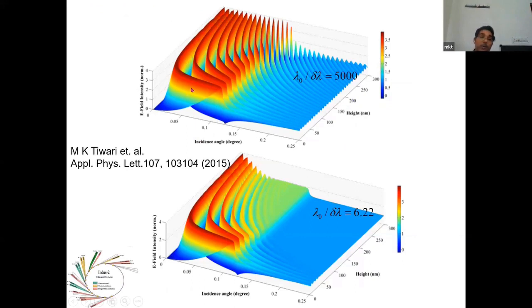So this is a critical boundary. Below the critical angle, you have the well-defined fringe pattern, the standing field, and this is where the monochromaticity is low. Then at some height, up to about 100 nanometer, we have a good amount of high intensity standing field, and slightly it is decreasing. At large height, from 100 to 250 nanometer, it is simply the sum of the two intensities. So if we have a particle size of 200 or 250 nanometer, then you have to take into account this temporal coherence in your calculus. Otherwise, you get some error in your calculus.